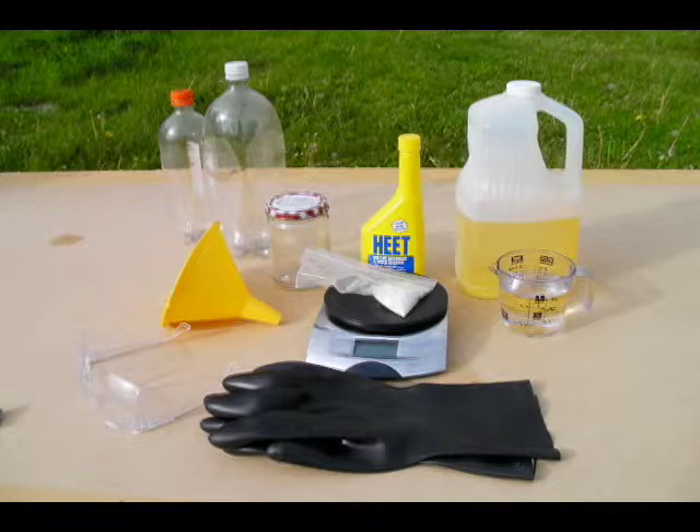In the past, many biodiesel enthusiasts made a demonstration batch using a kitchen blender. We strongly recommend that you do not make biodiesel in a blender. The high speed of operation can cause splashing of caustic chemicals, and rubber and plastic parts can degrade and leak.